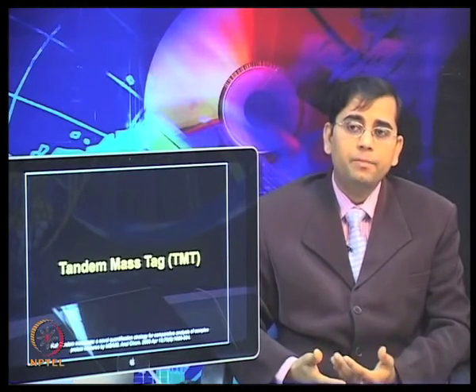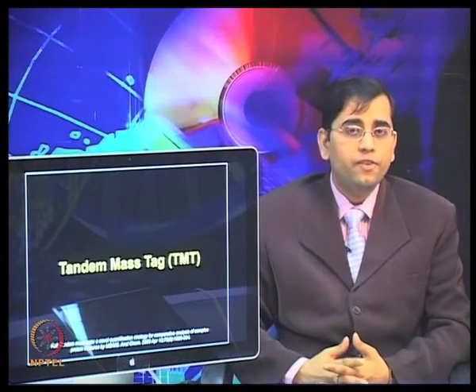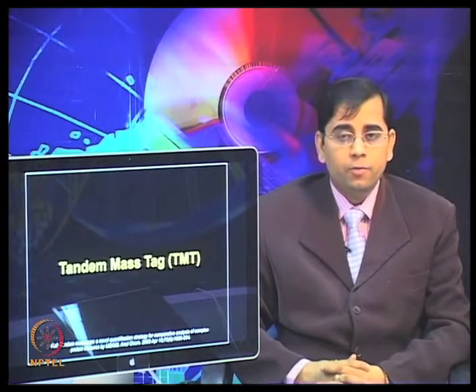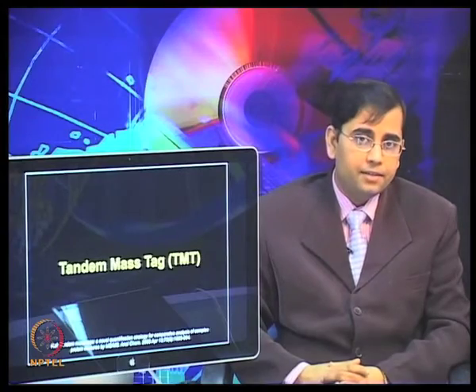Okay, so now let us talk about Tandem Mass Tag or TMT. This method is similar to the iTRAQ which we just discussed. TMT is also an MS/MS based quantitative technique which uses isotopomer labels referred to as tandem mass tags. It also provides accurate quantification of peptides and proteins. The tandem mass tags have been developed by Proteome Sciences and are currently commercialized by Thermo Fisher. I have given you the reference for the original study on tandem mass tags in the slide.